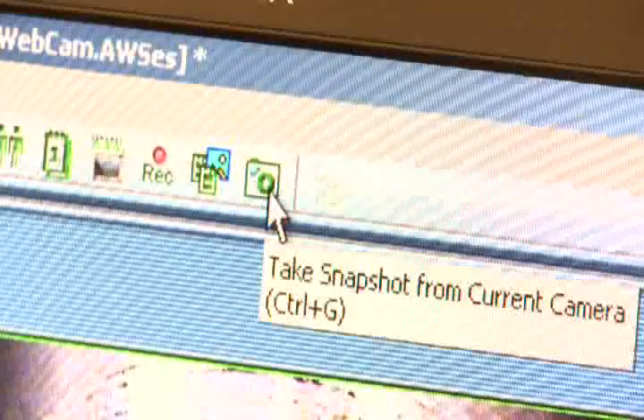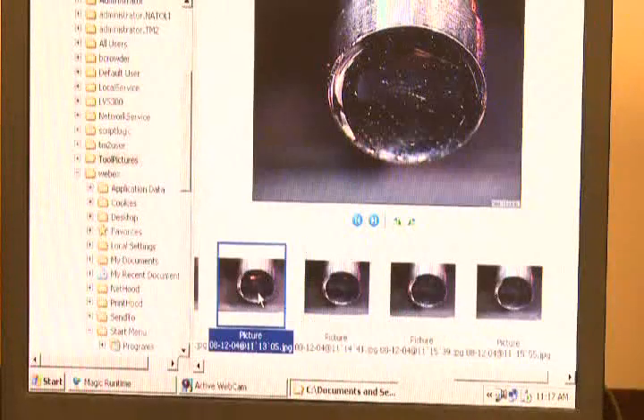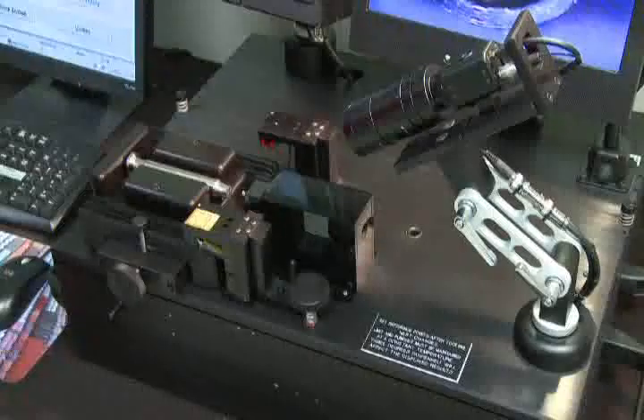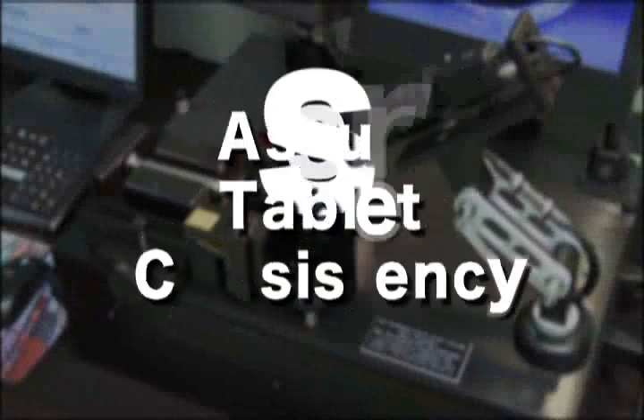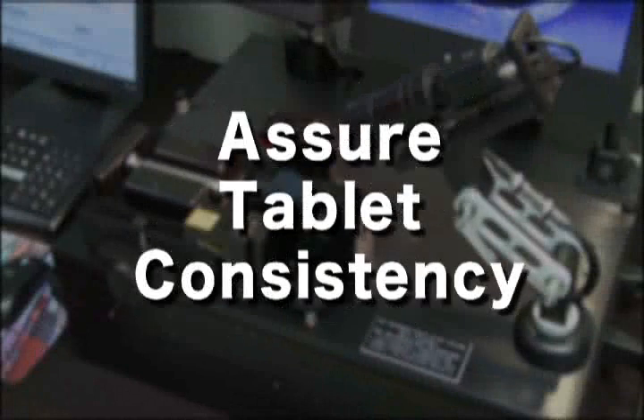You can take a snapshot and it will save the JPEG file to your hard drive. With the Natoli TM2 system, you will save time, guarantee inspection accuracy, reduce labor cost, and assure consistency with tablet thickness, hardness, and weight.